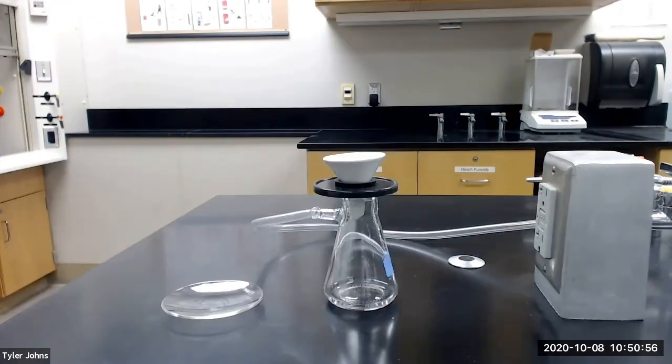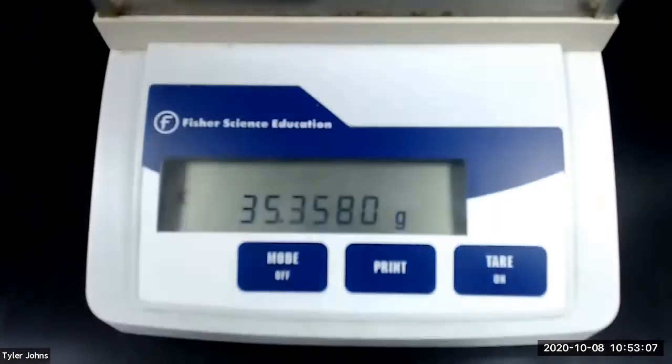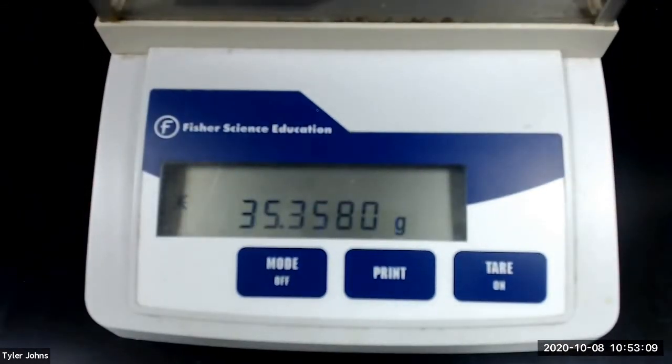While our crude acetaminophen crystals continue to air dry, we need to pre-weigh a watch glass. The mass of our pre-weighed watch glass is 35.3580 grams.